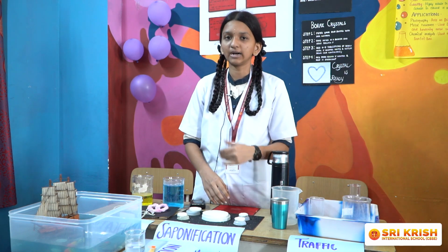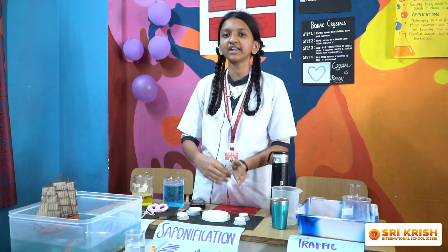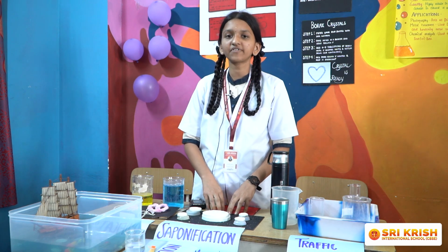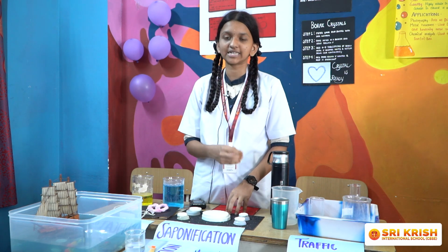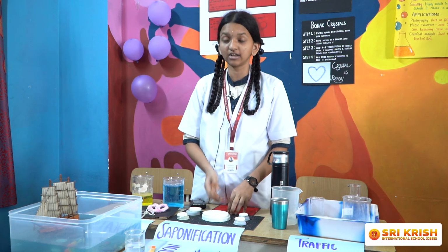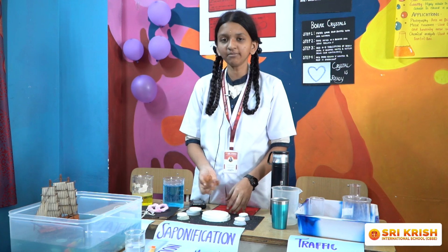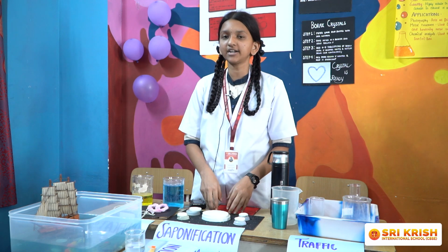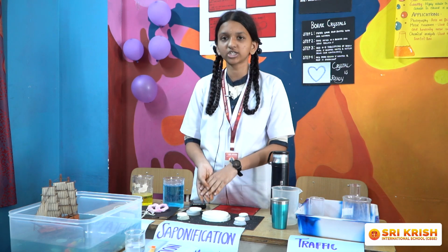Now mix sodium hydroxide solution and coconut oil in a large beaker and start heating it. Once it starts boiling, you could see some bubbles and the consistency becomes thick. At that time turn off the flame and add NaCl solution to it. Stir it continuously when you are adding NaCl solution.